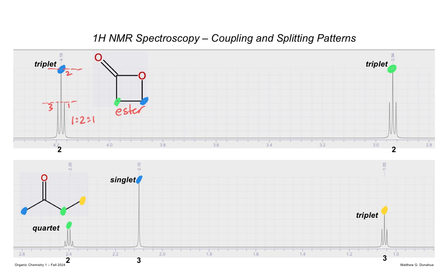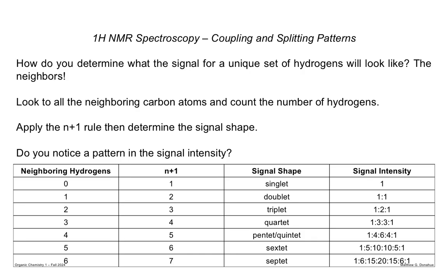And again, the numbers under there are 2 hydrogens, 3 hydrogens, 3 hydrogens. The chemical shift is important. It tells you the environment it's in. So we're going to talk more about the nature of these multiplets. You'll look at some pretty pristine examples of them and why the lines have the intensities they do.